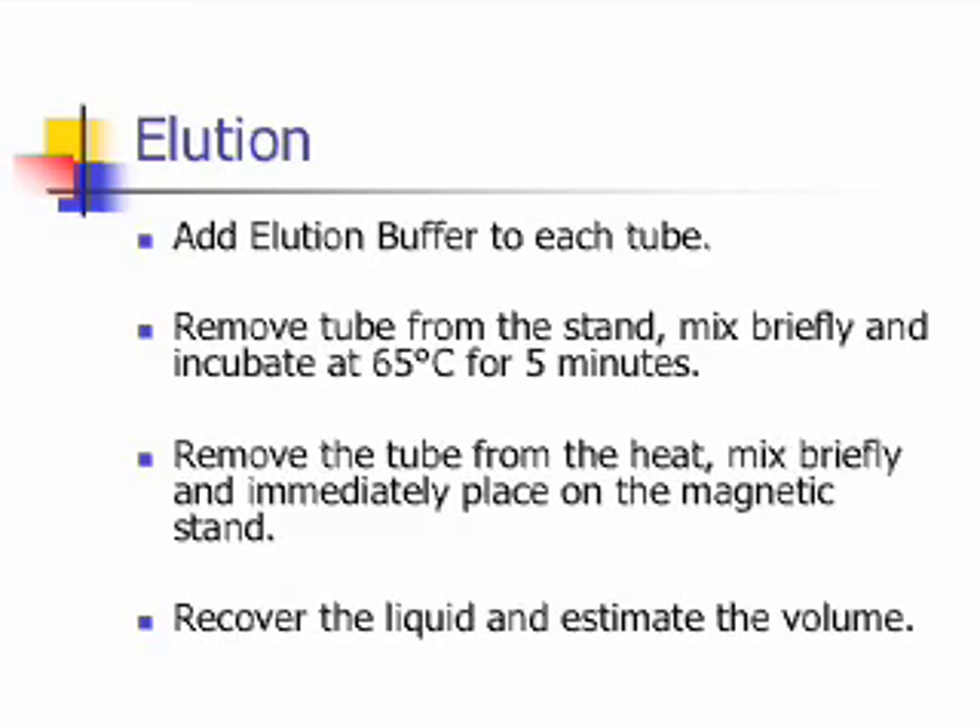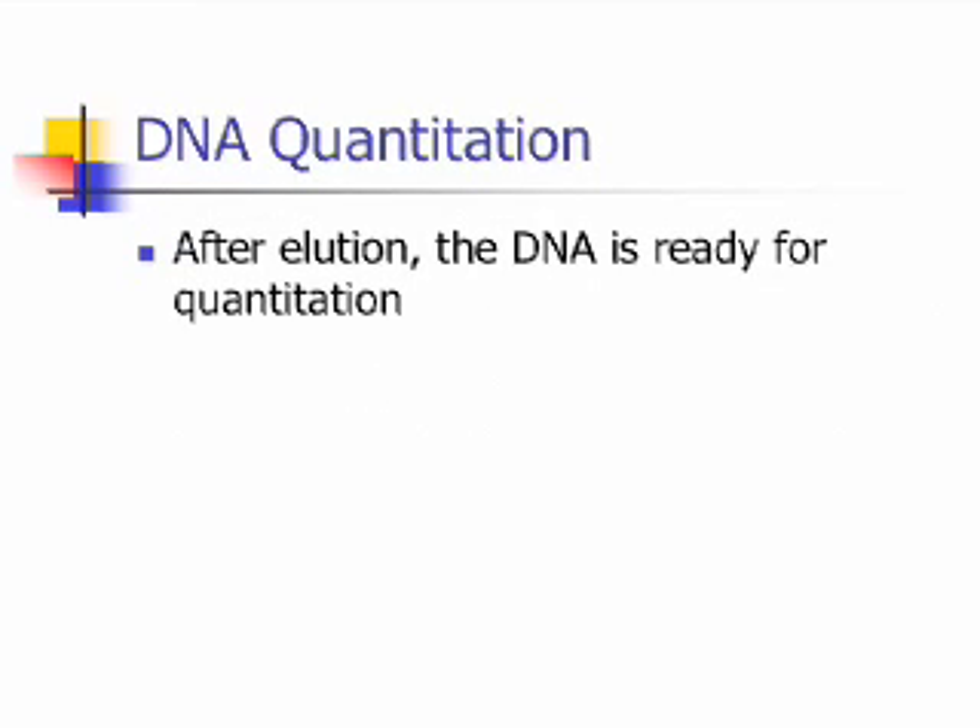The final step in the process is called elution. Add elution buffer to each tube, remove the tube from the stand, mix briefly, and incubate at 65 degrees Celsius for 5 minutes. Remove the tube from the heat, mix briefly, and immediately place on the magnetic stand. Recover the liquid and estimate the final volume. After the elution step, the DNA is now ready to go on to the next stage, which is called quantitation.